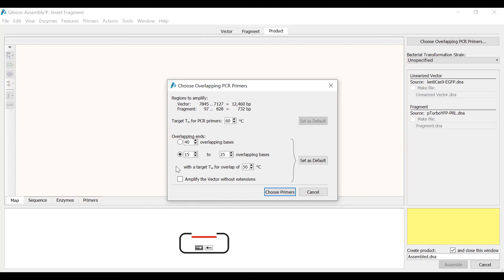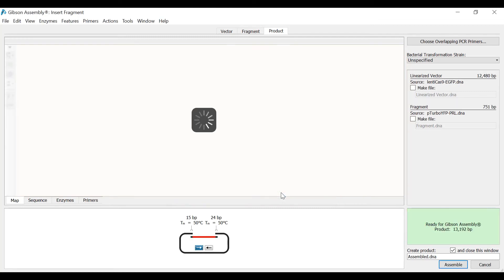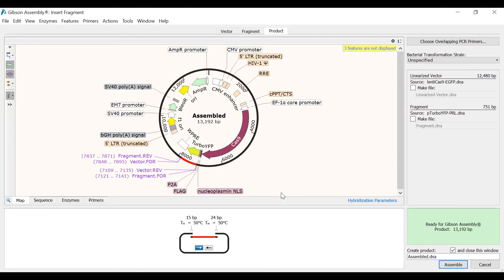I will now select Choose Primers to design the primers with these settings. In the schematic at the bottom you will see a summary of the simulation. The fragment is colored in red, which overlaps with the vector colored in black. In this example the overlapping regions are 15 and 24 base pairs.